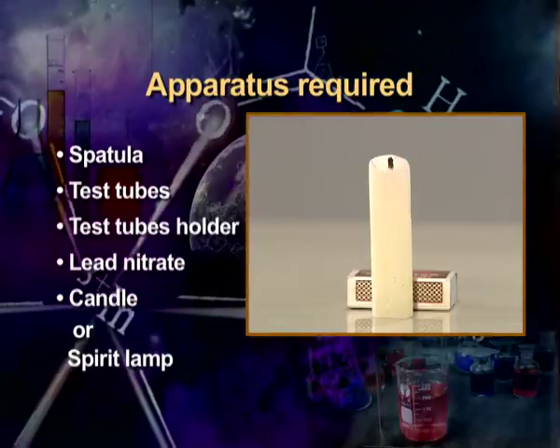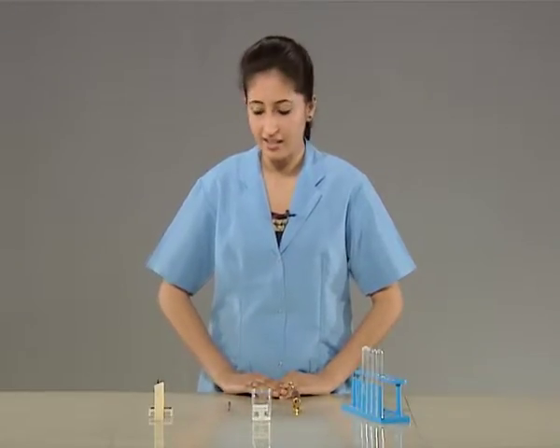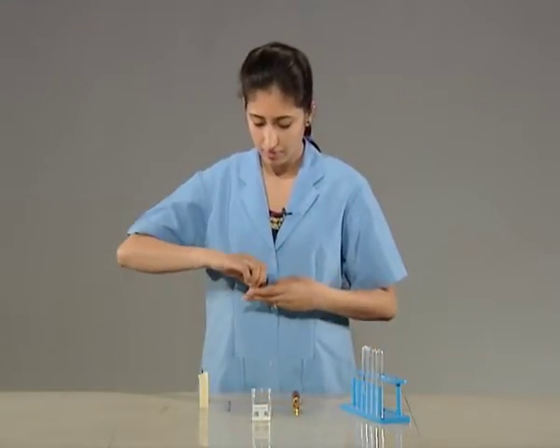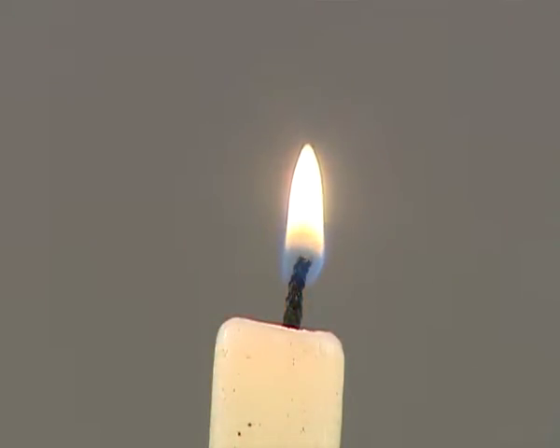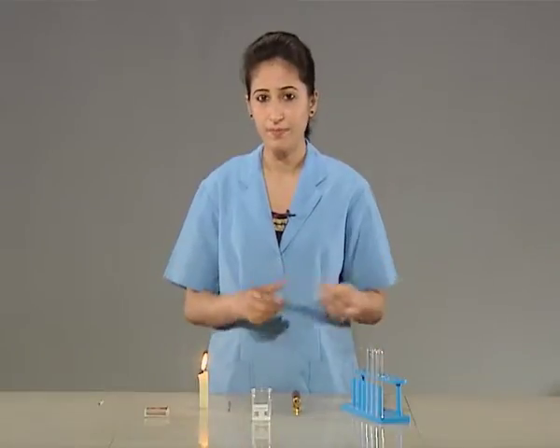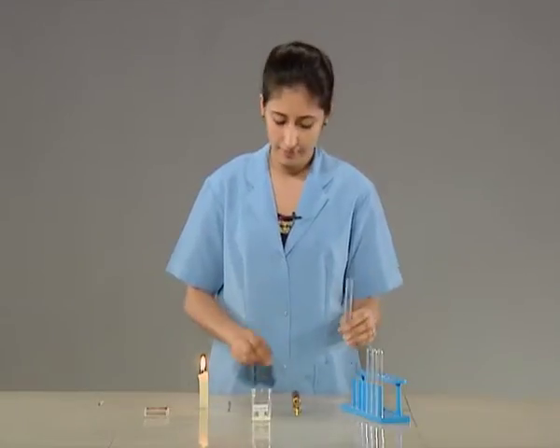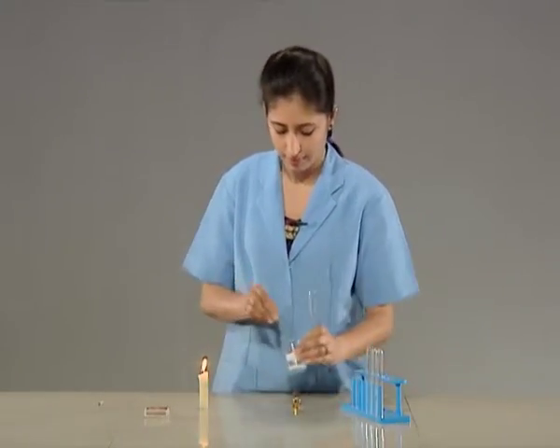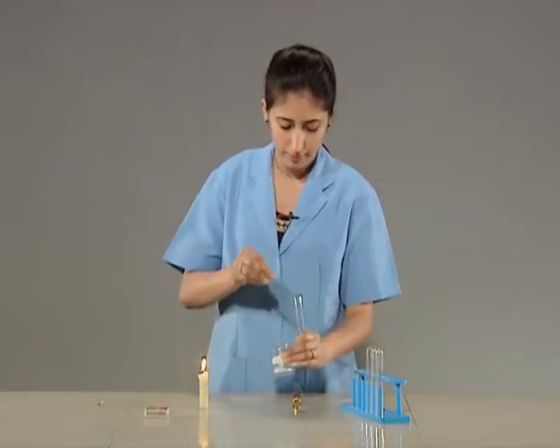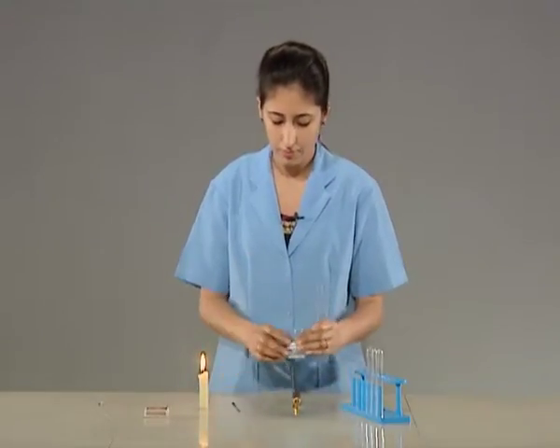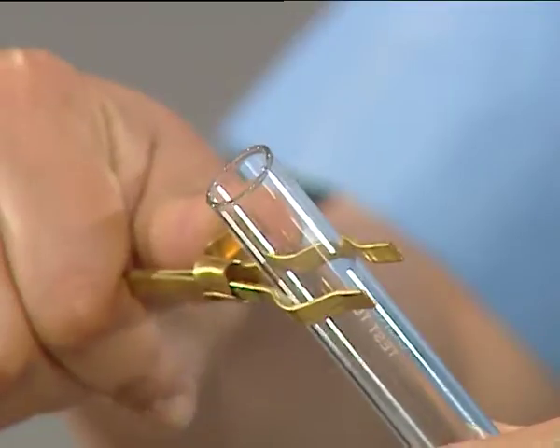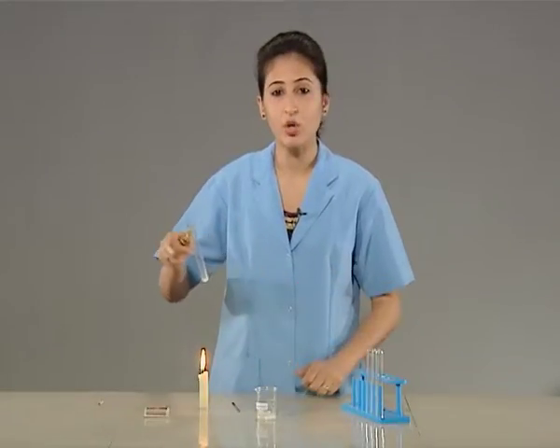We can also use a spirit lamp. Let us first light the candle, take a test tube and add one or two spatula of lead nitrate to it. Now, hold it with the help of a test tube holder and heat it over the flame.